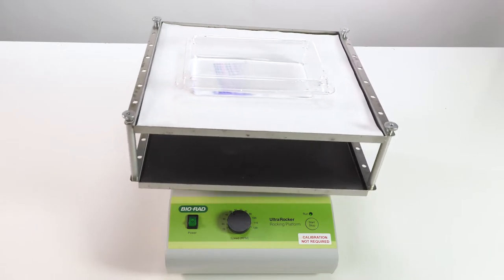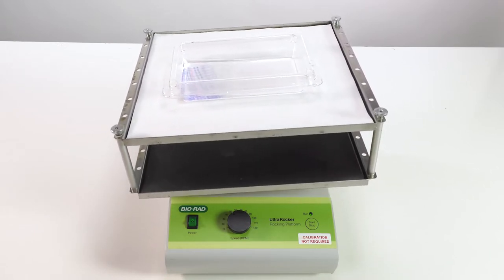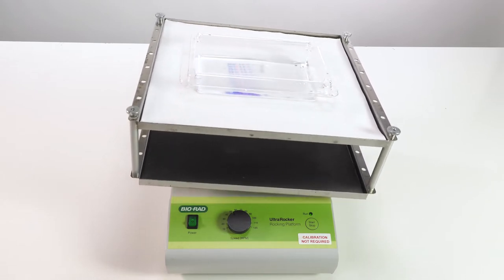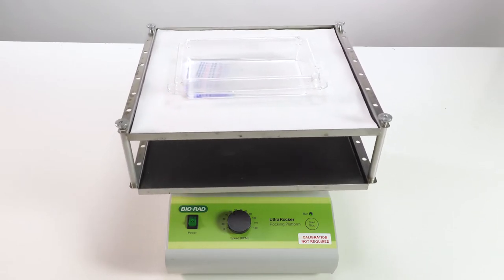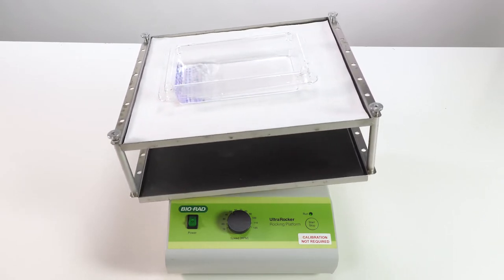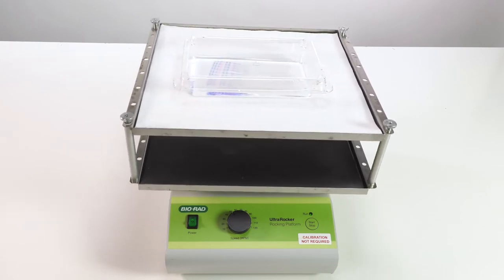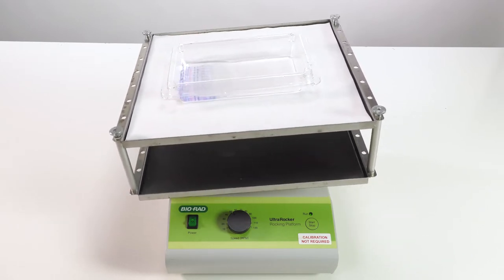After you have removed your gel from the cassette, equilibrate the gel in a tray with transfer buffer for 15 minutes on a rocking platform. This facilitates the removal of salts and detergents. If not removed, the excess salts will cause heat buildup during transfer.